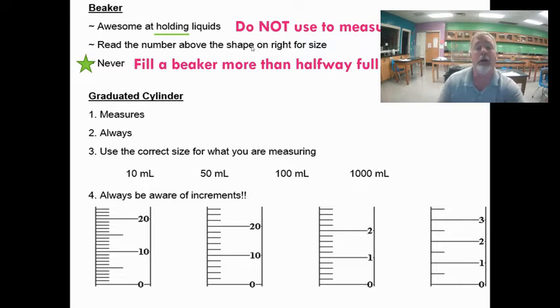All right, so on to the graduated cylinder. So I've got two in front of me here. They're both glass. I'm hoping these show up okay. This one, because it's got this little red strip, sometimes it makes it a little bit easier to see and read. So I'm going to use this one for my example. I also have another one here, a smaller one. Let's see, if I hold a paper up behind it, it's got some tick marks on it too.